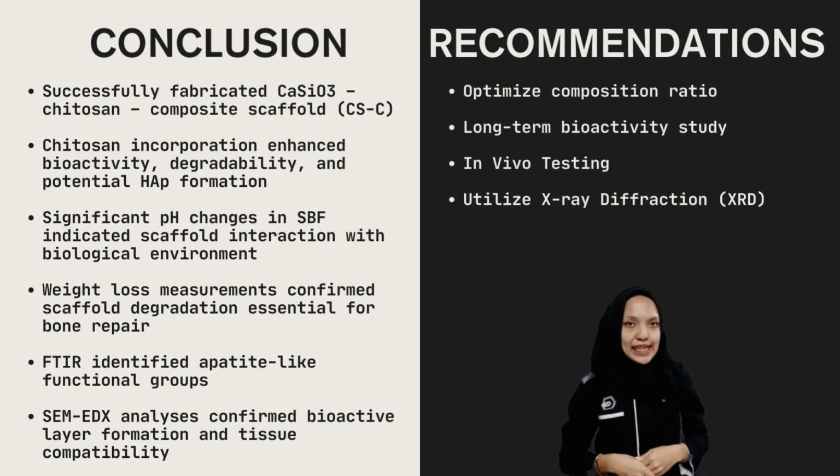In conclusion, this study successfully fabricated calcium silicate and chitosan scaffold with potential hydroxyapatite formation. The analysis conducted also showed potential bioactive layer formation.